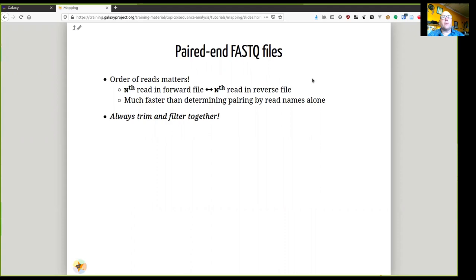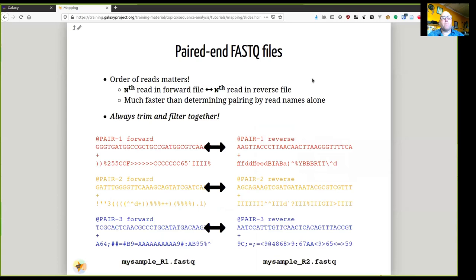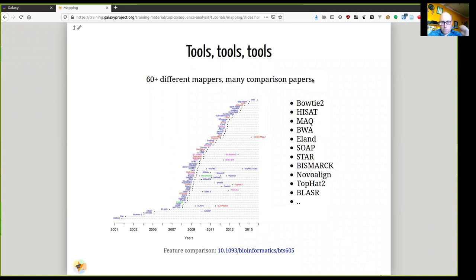So that means that when you are doing trimming and filtering, you should always process the forward and reverse files together. Otherwise, you might end up with a situation where if you remove a read from one of the files, you now end up with misaligned files.